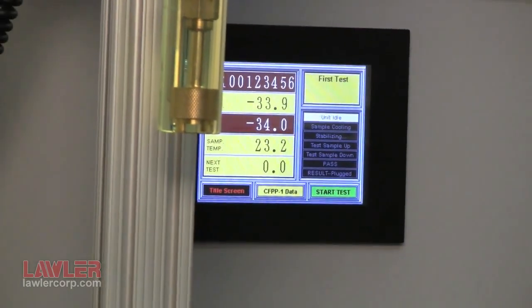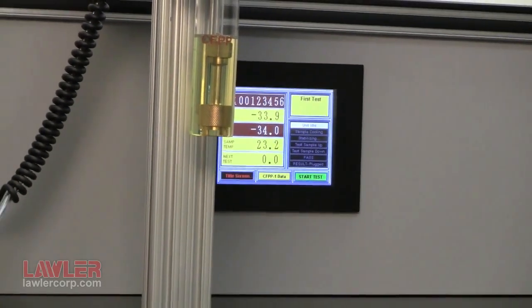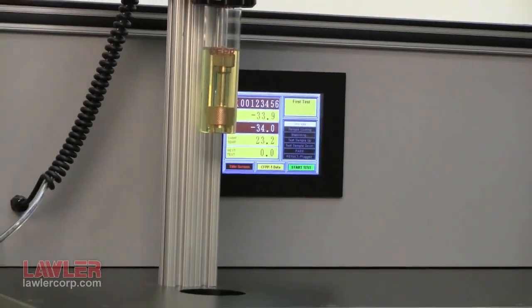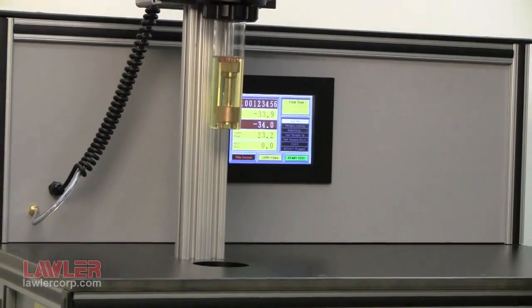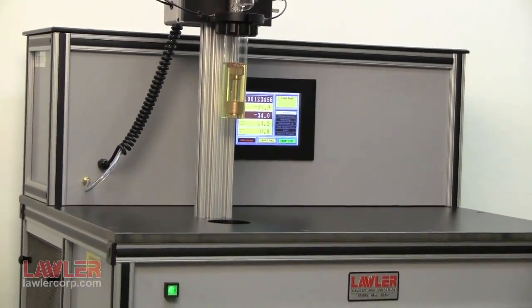At the end of a test, if desired, the aspiration times can be checked. As you can see, the sample volume, glassware, brass filter assembly, and procedure are used per the manual method, making test verification easy.